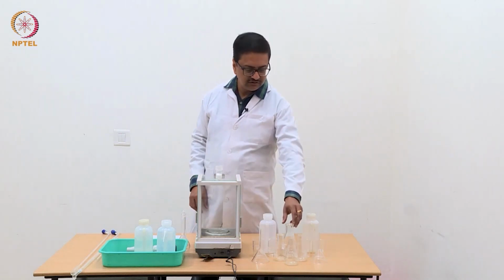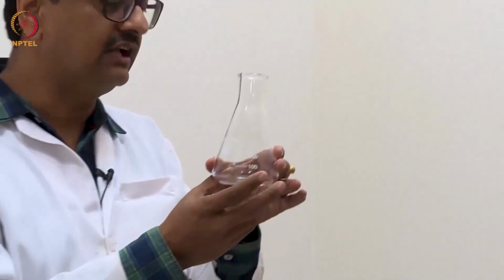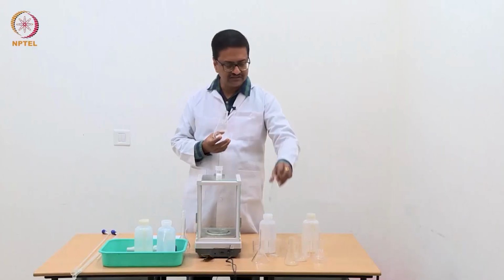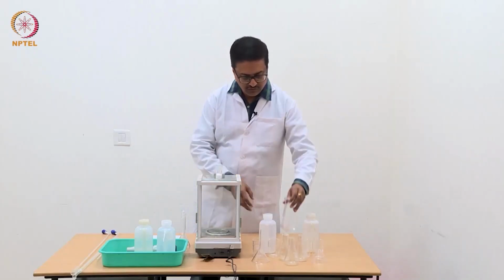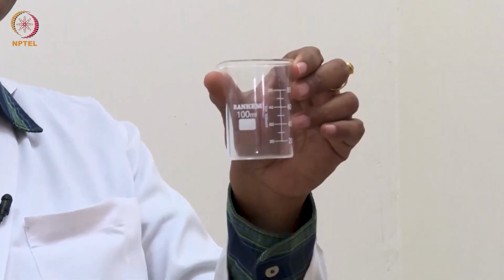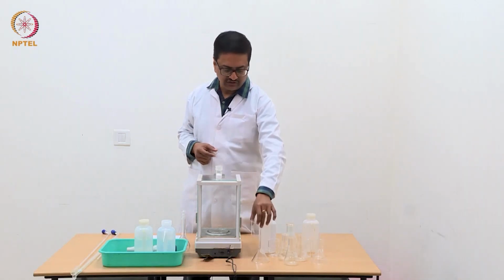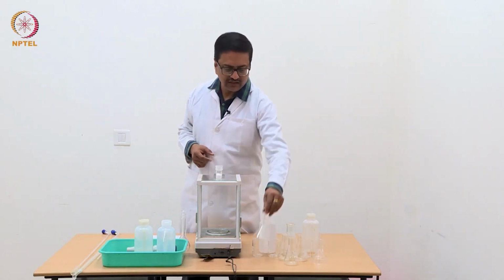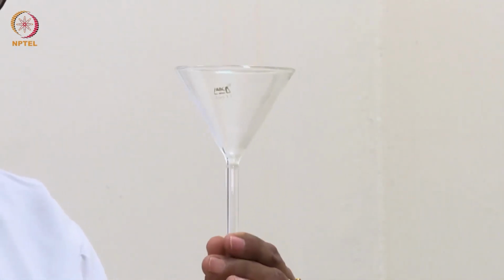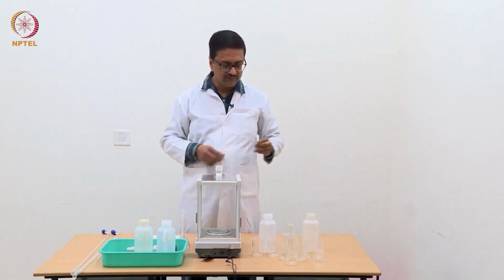In addition to that, we will need some conical flasks like this, 250 ml conical flasks or 100 ml conical flasks for titration. We will need 100 ml beakers for titration of the solutions using a potentiometer or a conductivity meter, and then we will require a glass funnel to prepare the primary standard solution and while transferring liquid from one container to another.